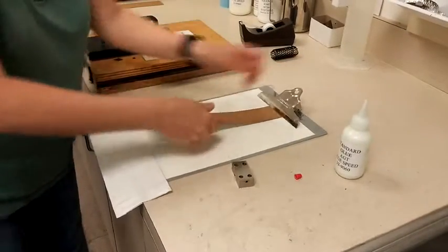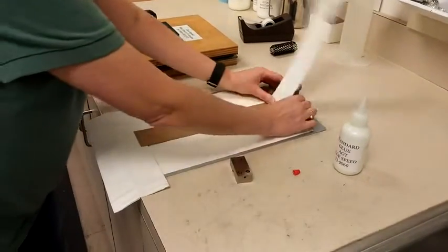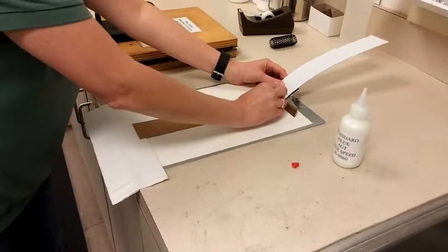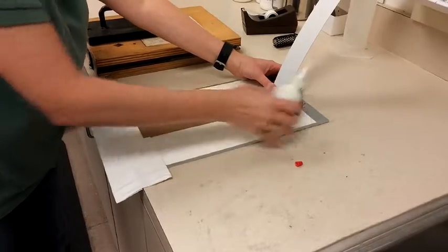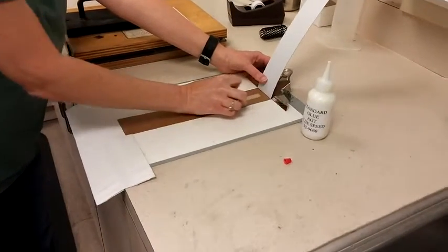Glue speed is a test used to determine the time required for standard glue to achieve fiber tear. The glue is applied to the back side of a sample with a bird bar applicator to provide a uniform wet film thickness.